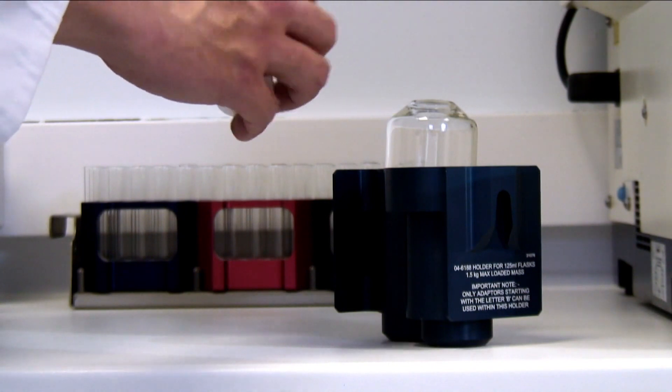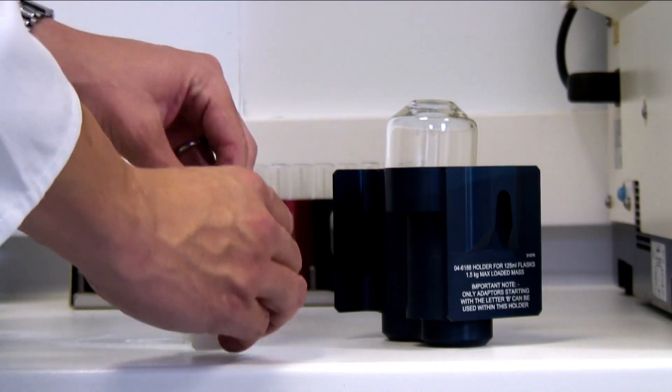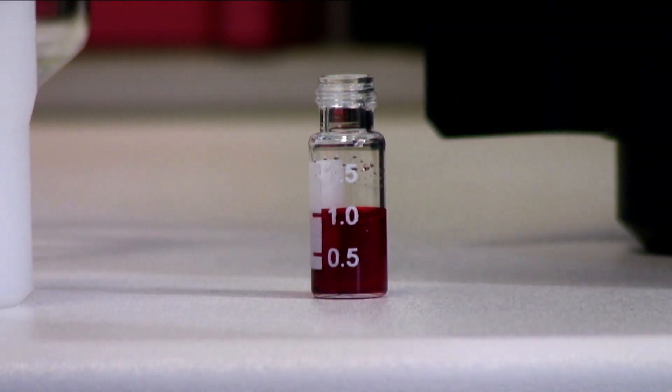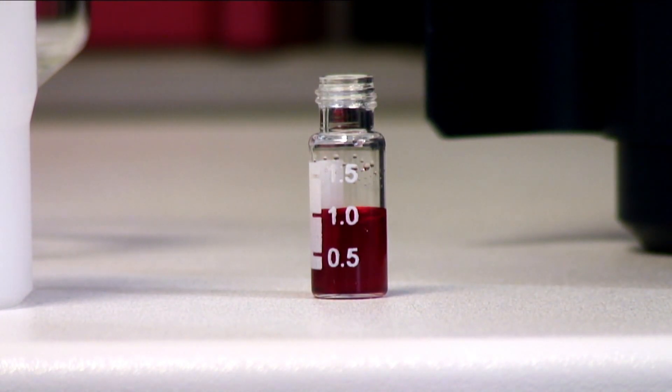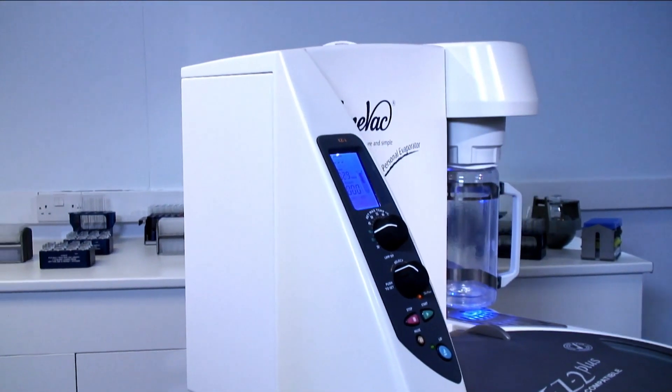Sample Genie enables a large volume to be concentrated directly into a vial of your choice. The design of Sample Genie means that the vial is insulated from heat, and therefore only the solvent in the flask dries.